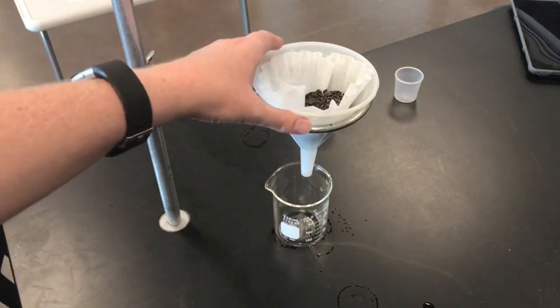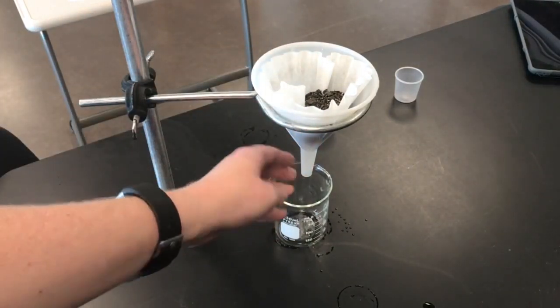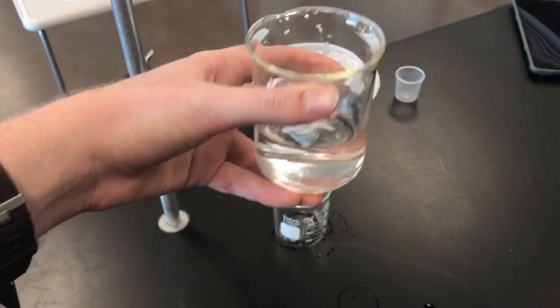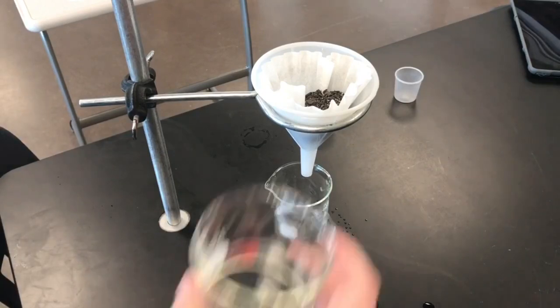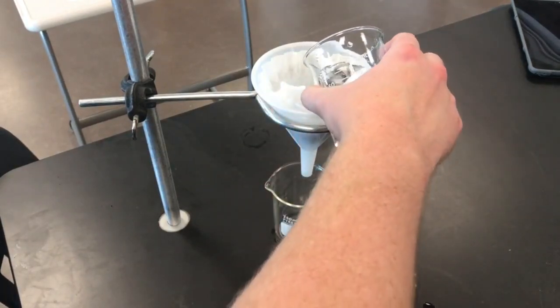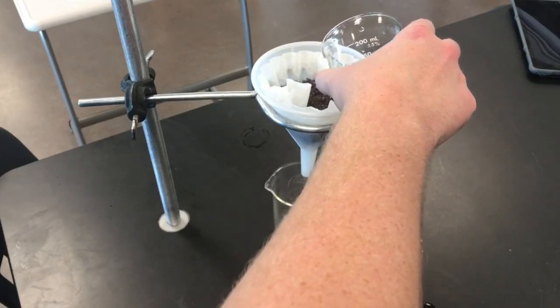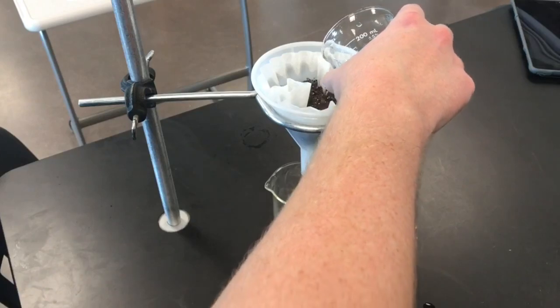I've got my soil B in my coffee filter. I've got a beaker under the funnel here to catch all of that excess sulfuric acid solution. I've got my sulfuric acid, 100 milliliters. And so I'm going to pour through, just like part one, I'm going to pour through 3 times. Make sure not to dump it all out at once. Just pour it through nice and slow.